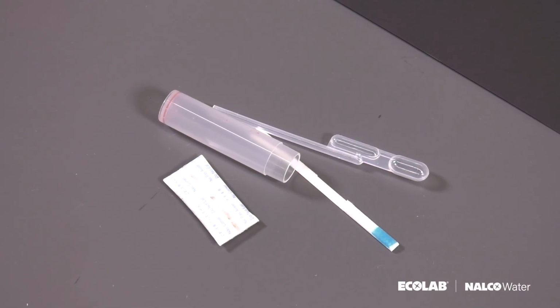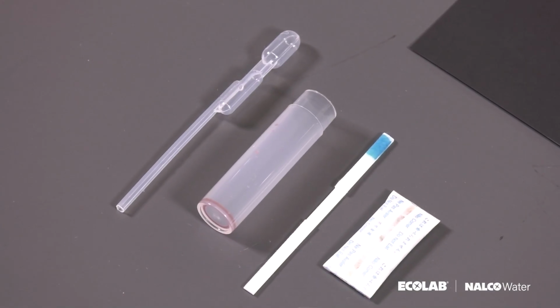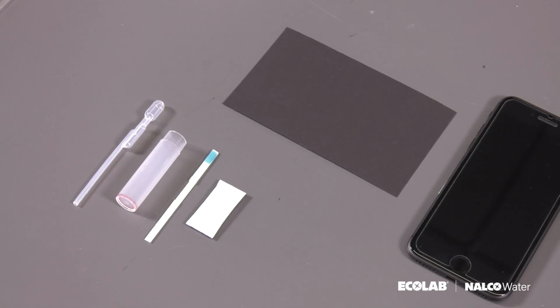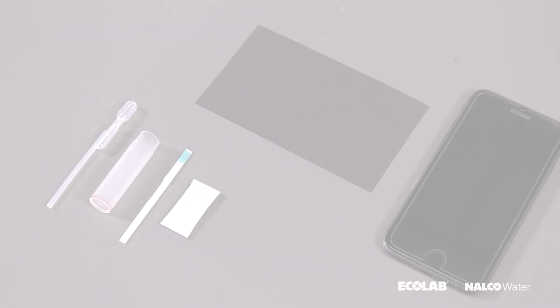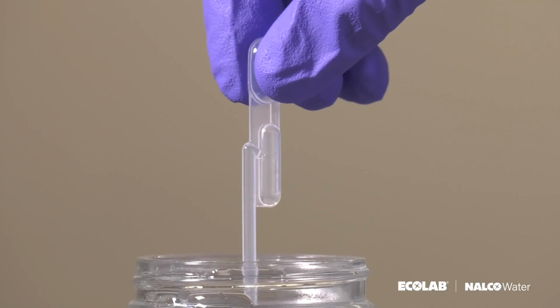Verify all test kit items are available, which includes volumetric pipette, 1 test vial, 1 test strip, 1 desiccant, 1 backdrop. We'll now go over a few quick and easy steps on how to run a test. Add the water sample to the test vial using the pipette, 1 squeeze.